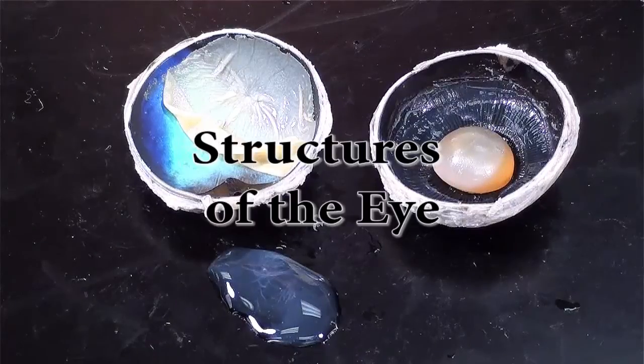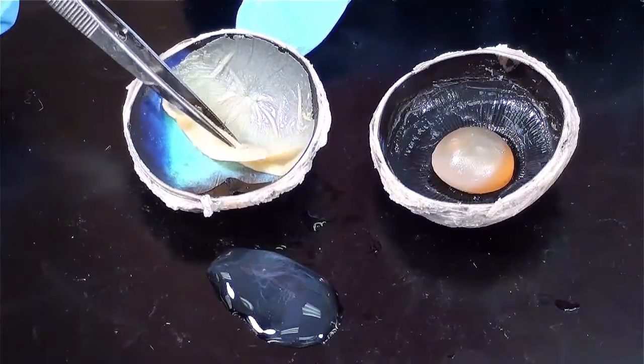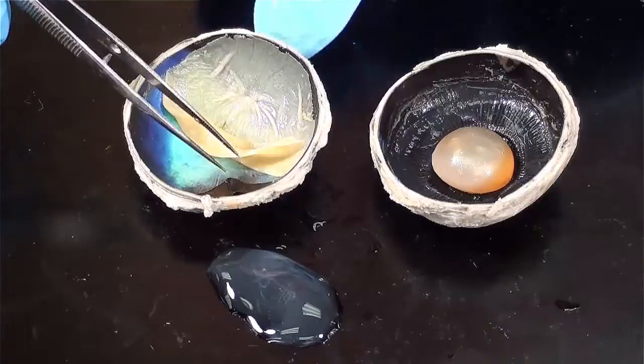This is a dissection of the internal structures of a cow eye. This is the posterior half of the eyeball. This folded beige layer is the retina. I folded it back so we can look at the structures that are deeper to it.